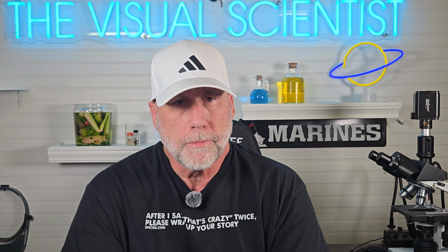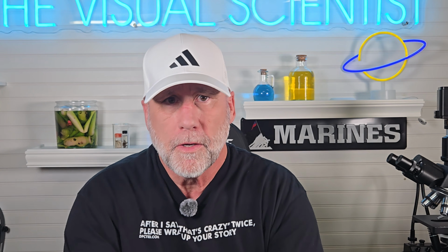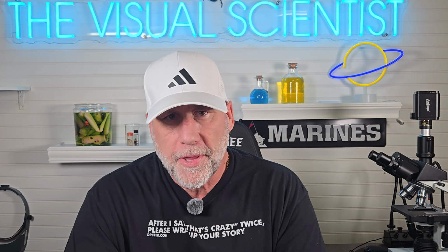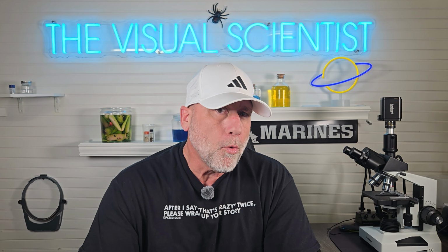I'm not a doctor. I'm a guy with a microscope. But the data is what the data is. So now let's talk about what you've been buying. And here's what makes this complicated. It still meets the FDA's legal definition of honey. Are you kidding me? So let's look at what we found.